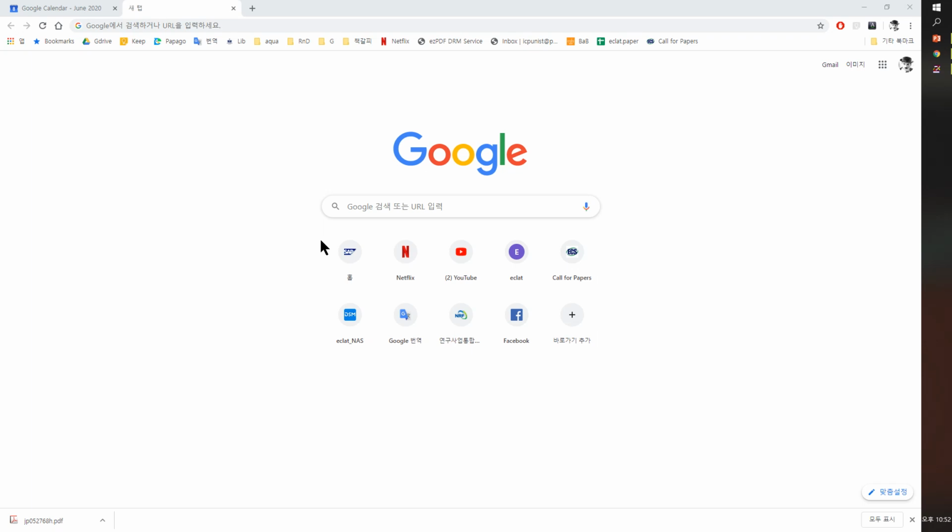In this presentation, I'd like to use the software named GView, which is provided by Scribner Associates. So let me introduce how to download this freeware from the Scribner website.